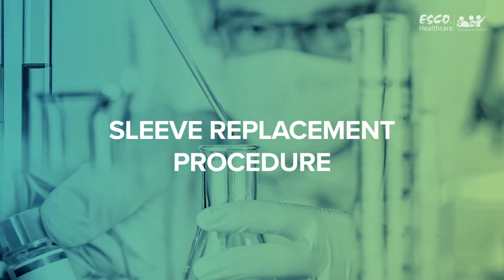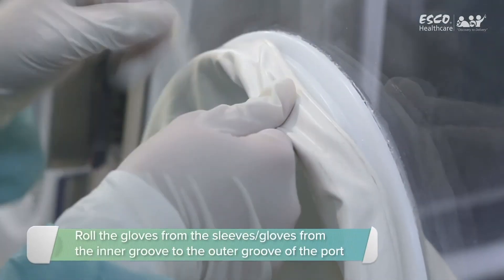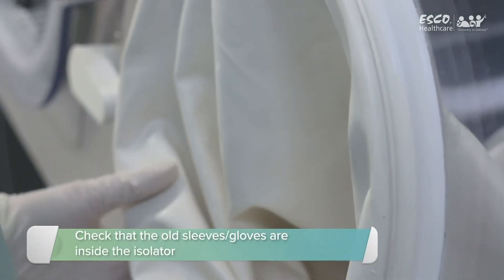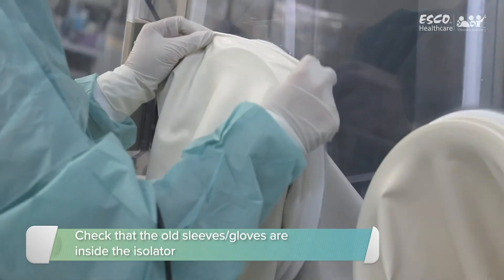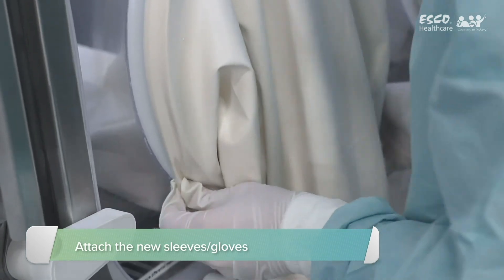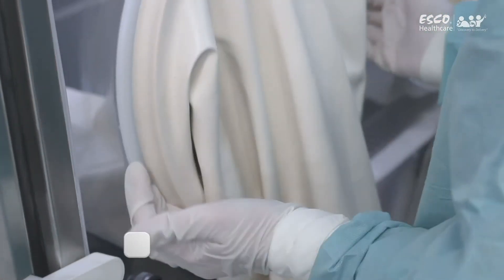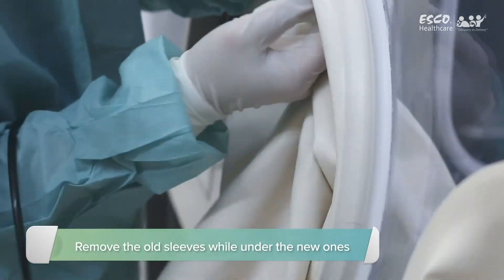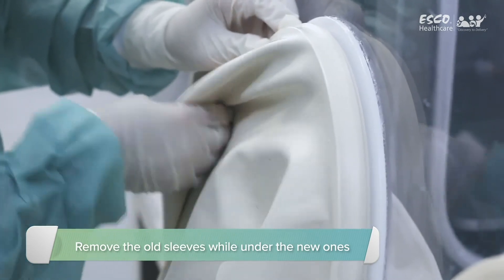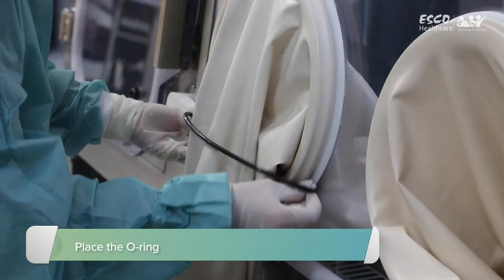Sleeve replacement procedure. Remove the O-ring. Carefully roll the open end of the old sleeve from the inner groove to the outer groove of the port. Ensure that both the old sleeve and glove are inside the isolator. Attach the new sleeve and ensure that the thumb of the glove is positioned at the top. Remove the old sleeve while under the new one. The procedure is now complete. Return the O-ring into its original place in the groove of the glove port.